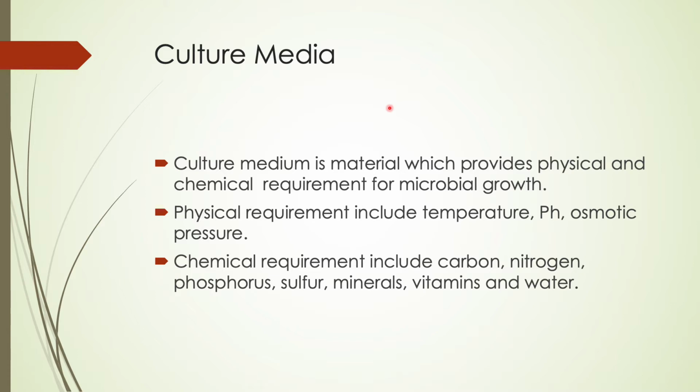Now, coming to the culture media, the composition of the media. What is the composition of the media? The composition of the media includes agar. Agar is the most common solidifying agent used in microbiological media. So what is agar actually? Agar is a polysaccharide extracted from marine algae. Agar melts at 84 Celsius and solidifies at 38 Celsius.